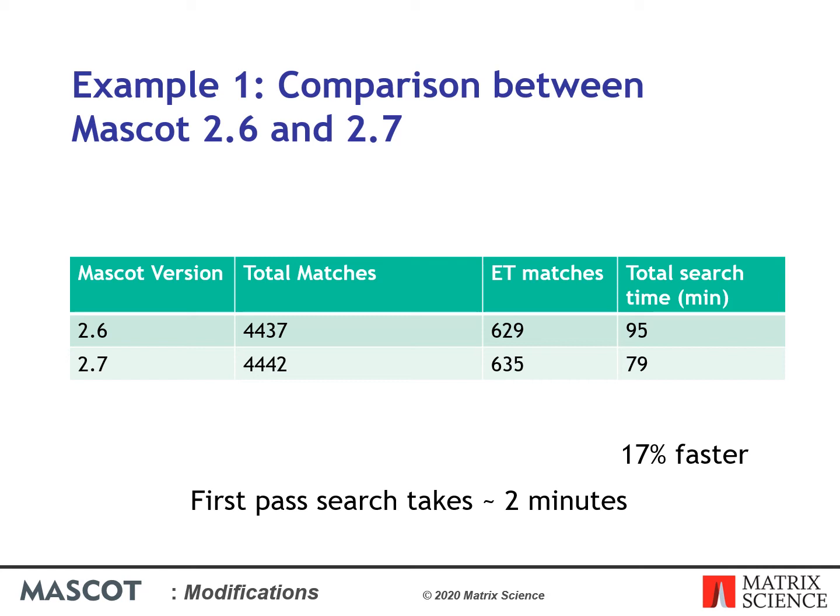One of the main reasons for this is the limit on the number of modified sites applied by the max pep num modified sites setting. In Mascot 2.6, there was no limit, so, especially on longer peptides, the error-tolerant search pass can end up testing a lot of combinations and modifications which don't actually yield reliable results and are therefore never reported. The max pep num modified site setting of 5 in Mascot 2.7 is preventing this, so the search takes less time.